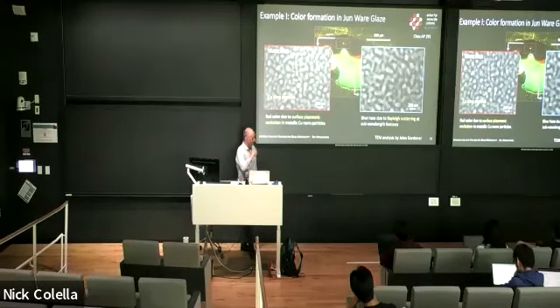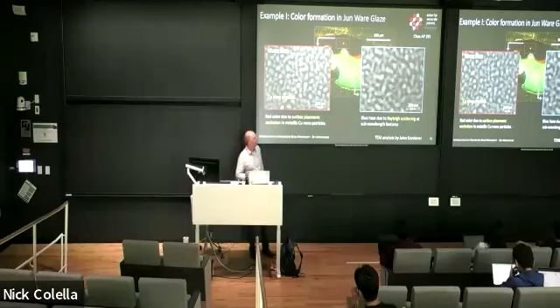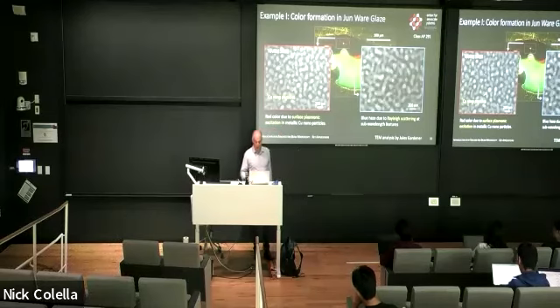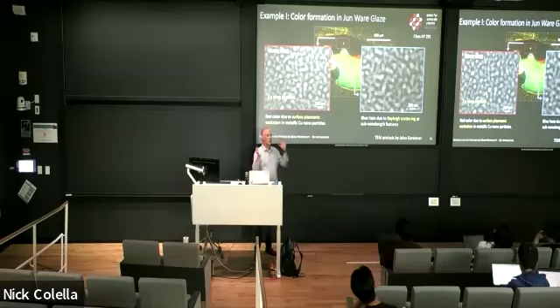And so we found out that basically in the red part of this glaze, there are tiny nanoparticles, which are actually producing the red color. And then we could also identify sort of a two-phase material which affects the optical properties of the material and produces a certain effect on the color. So we were able to connect the optical properties of the glaze with the internal nanoscale structure of the material itself.